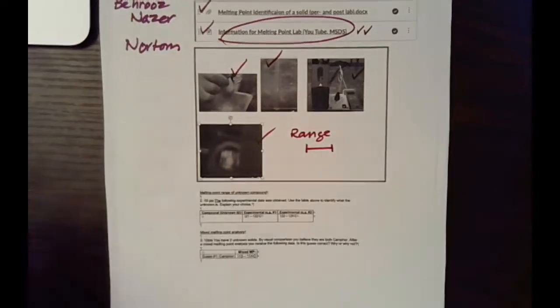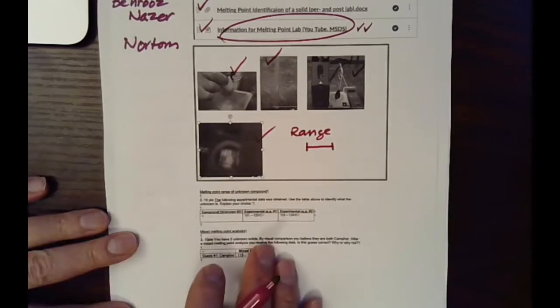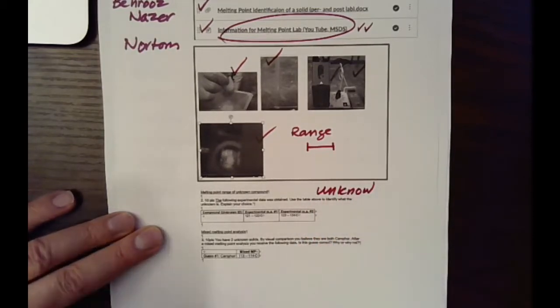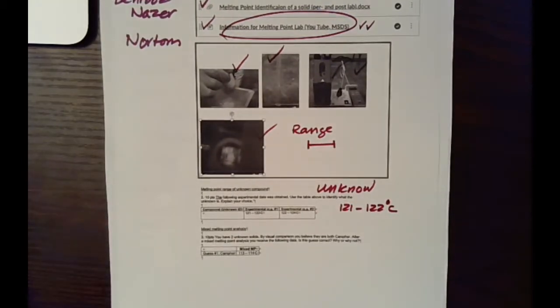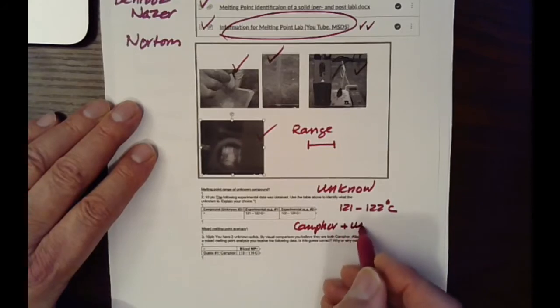You went home, finished the lab report, brought it back 2 weeks later. Again, this didn't print clear, but you reported that when you were taking your unknown, and you melting it, you have 121 to 122 degrees C, and then you told yourself, based on the data you had, that your unknown is camphor. So you put a little bit of camphor and your unknown together.